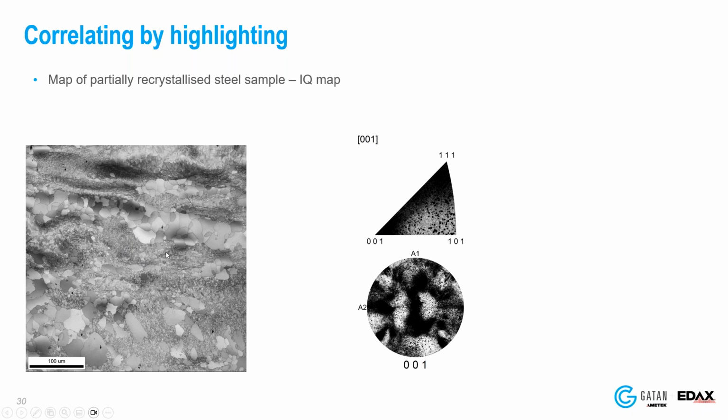If I make an inverse pole figure plot for that, you can see that I have some dots. These probably correspond to the recrystallized grains, and these very large black areas are caused by the deformation. So if I have lattice bending, this orientation just spreads out over a large area. But you can't see if you have any orientations for those recrystallized grains in those dark fields.